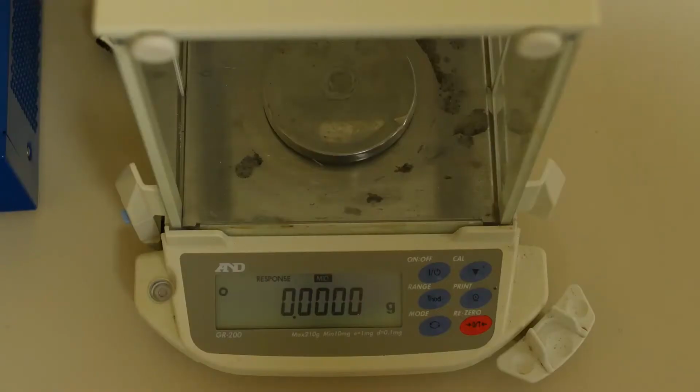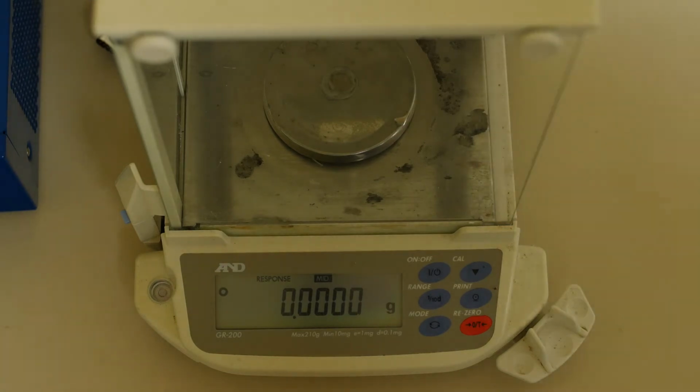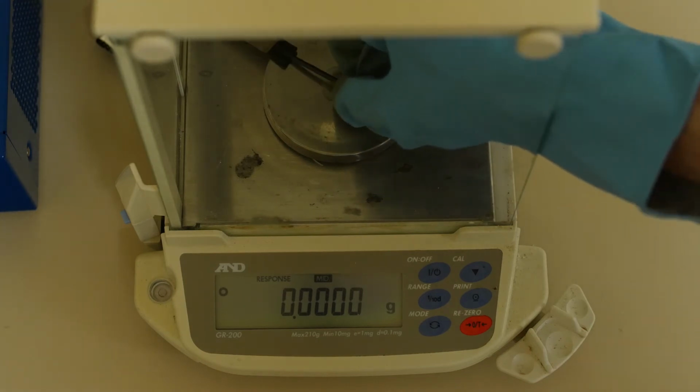Finally, the coupon is weighed. This series of steps, photographing, cleaning, drying, and weighing, must now be repeated twice more for the 2 other coupons.